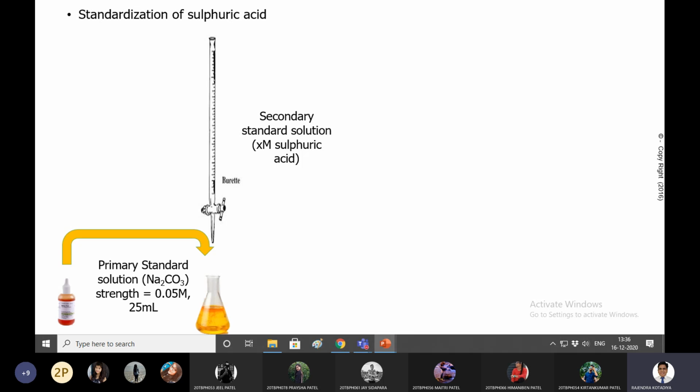Methyl red has the property that it shows a different color in acidic solution and a different color in basic solution. Okay, so initially the conical flask contained a basic solution, so its color was yellow. As it starts becoming acidic, because extra sulfuric acid is coming in, it changes to dark orange red. Yes, you will find the color change like this. It will change to pink color. That is the property of methyl red. So in different strength, in different medium, it has different color ability.